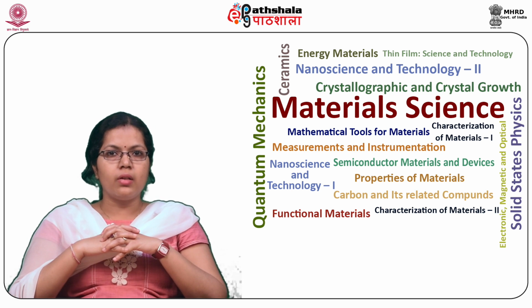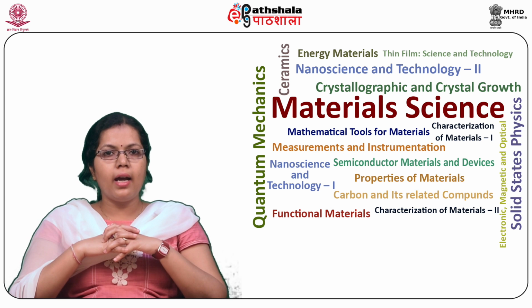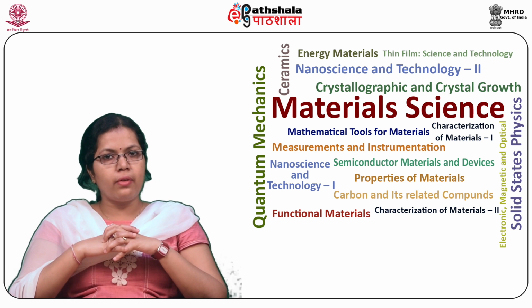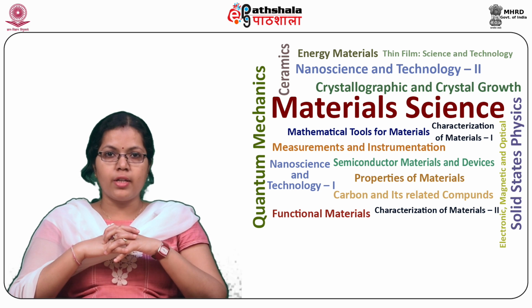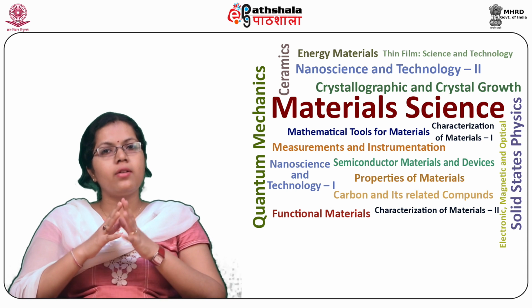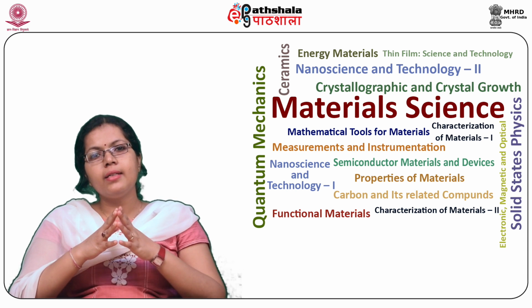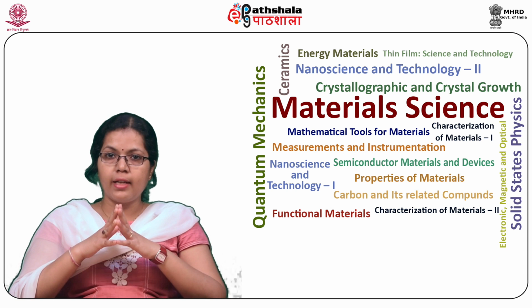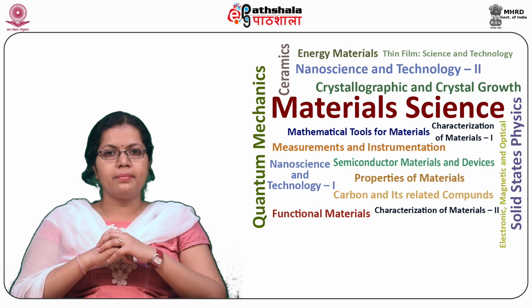This chapter reviews the interactions of ultraviolet, visible, and infrared radiations with matter. Irrespective of differences in the instrumentation, all spectroscopic techniques have many common attributes. The similarities as well as differences between various spectroscopic techniques have been outlined.